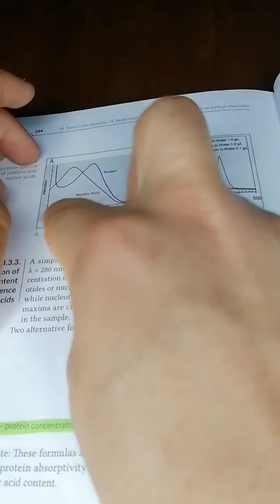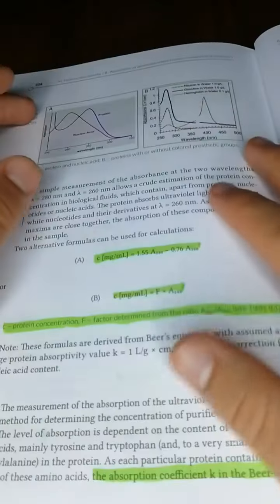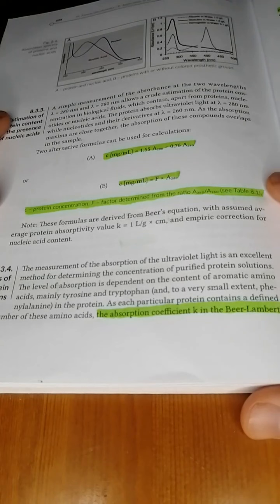If it's going the other way, then it's a nucleic acid. Then we can figure out how much is going up compared to how much is going down to figure out the components, so we can find the concentration of proteins and nucleic acid in that sample.